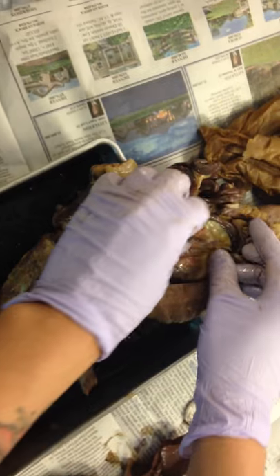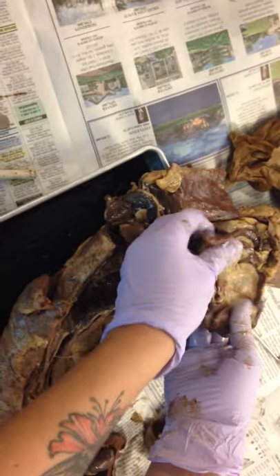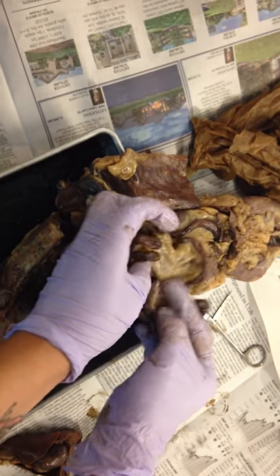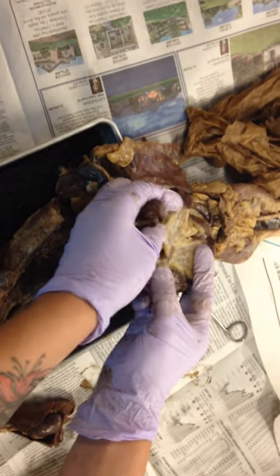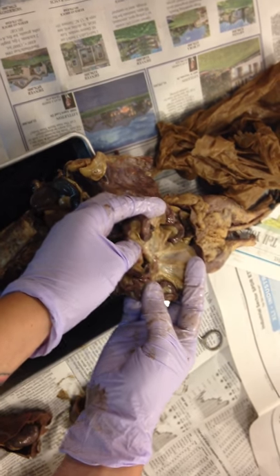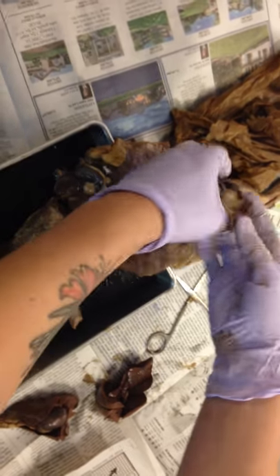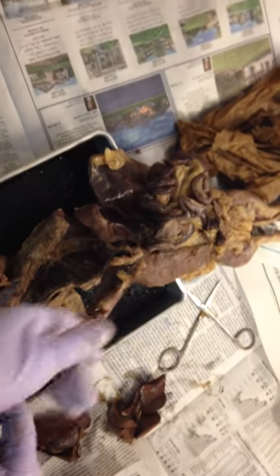Okay, and now here's a really cool part. So Juliana, you're going to have to back up in just a second. So one, what is all this stuff? What's the point of the mesentery? It holds it all together, and remember, this is also the physical connection between my digestive system and my circulatory system. We'll get to that more. So now I can see part of my digestive system. Now I want to see the rest of it.